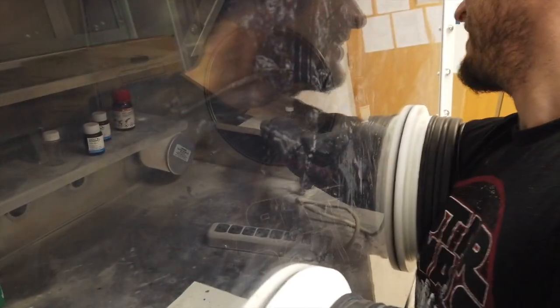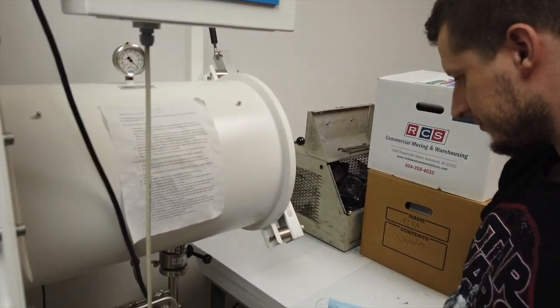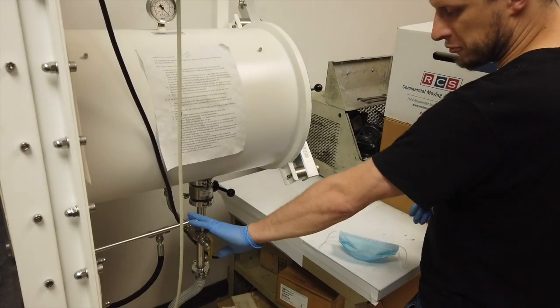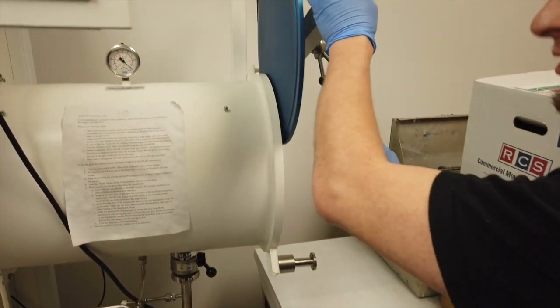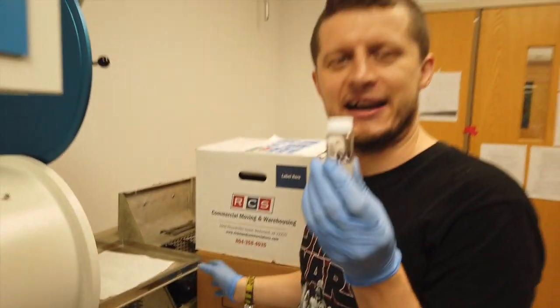So I will place it here, and now we have all argon here, and I will just close it down, the same as astronauts if they go to outer space from the International Space Station. So now it's closed. Here we have argon, here we have nothing. So I will set argon there, it's already there. Now it's closed and full of argon. When I open it, I will just spoil this part and release the argon. And surprisingly, I'm not dead, because argon is not dangerous.